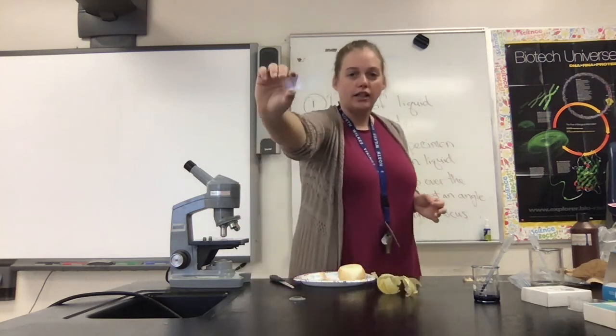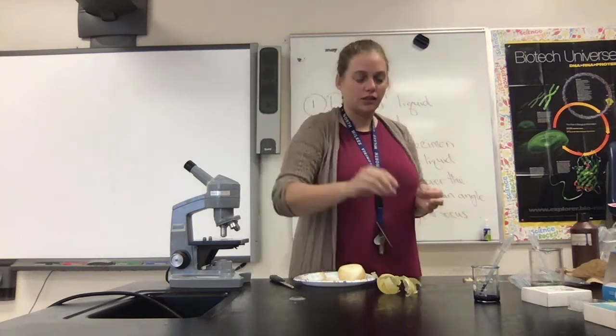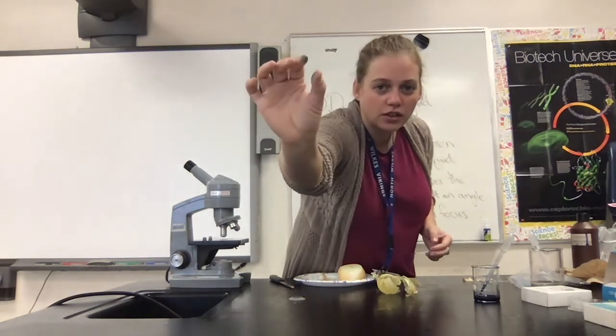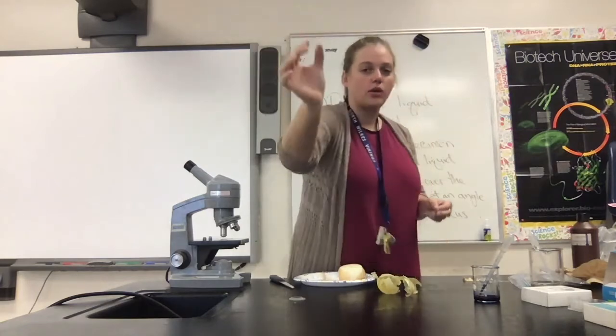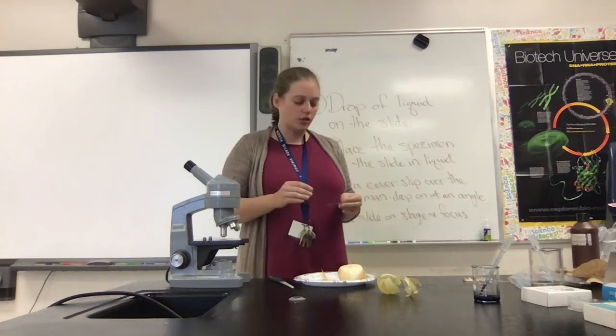We're going to be looking at several different types of cells today, and all of these cells are going to require us to make a wet mount slide. So a slide is a larger piece of glass or plastic that we're going to use to view an organism. And we also have cover slips, and these are tiny little pieces that we put over the specimen in order to protect the specimen and the microscope from touching one another.